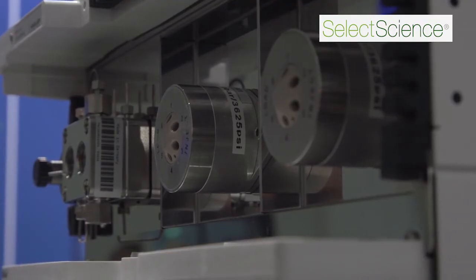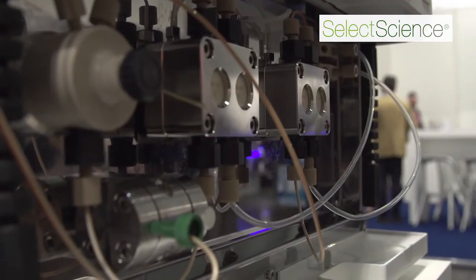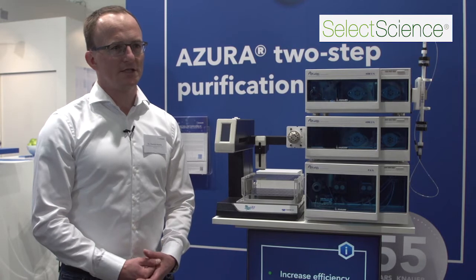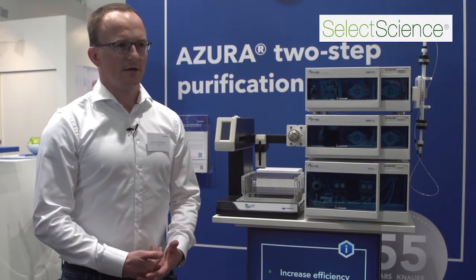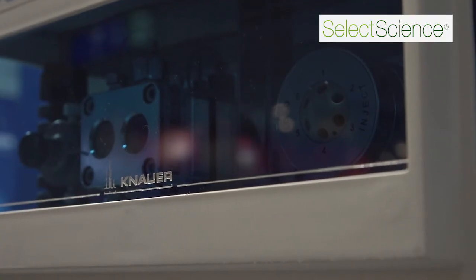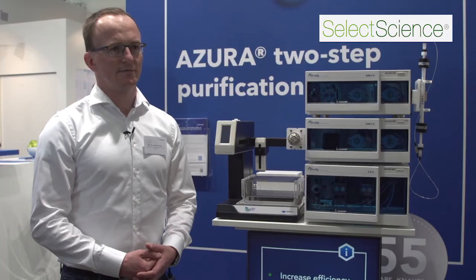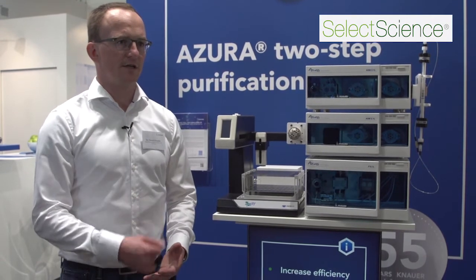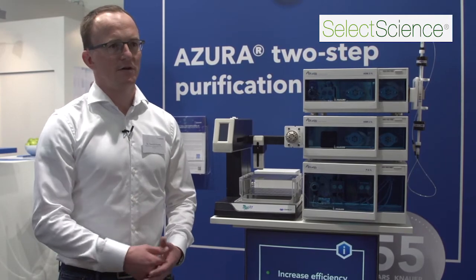The advantage of the Azura two-step purification system is its great flexibility. Not only can you do two-step purification, but you can do most purification processes. With the column switching valve you can also add up to five different columns. You can increase the system flexibility by buying additional system components like a fraction collector, a conductivity monitor, or a larger pump.